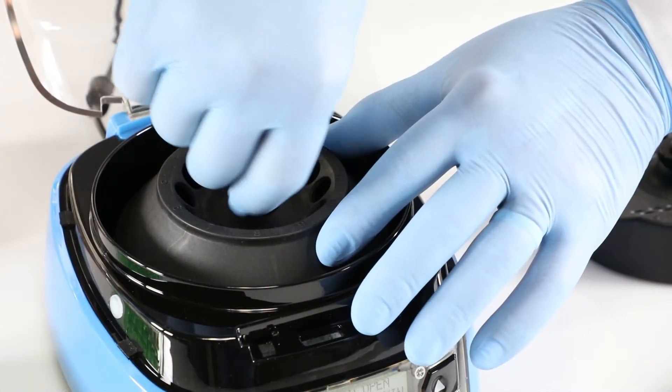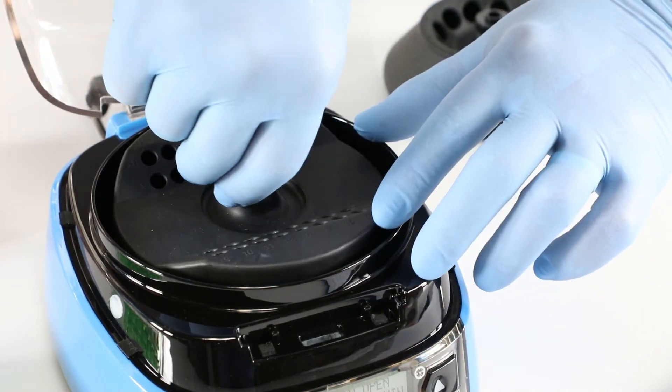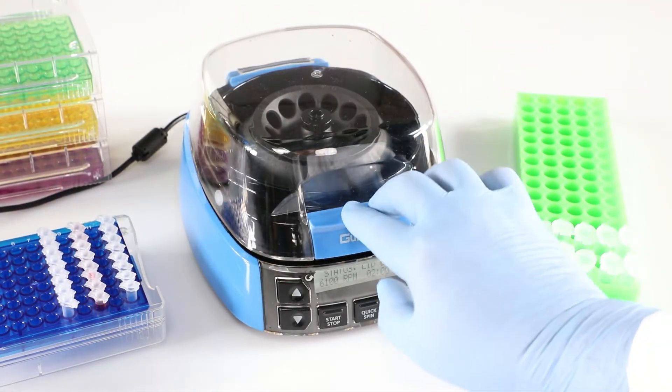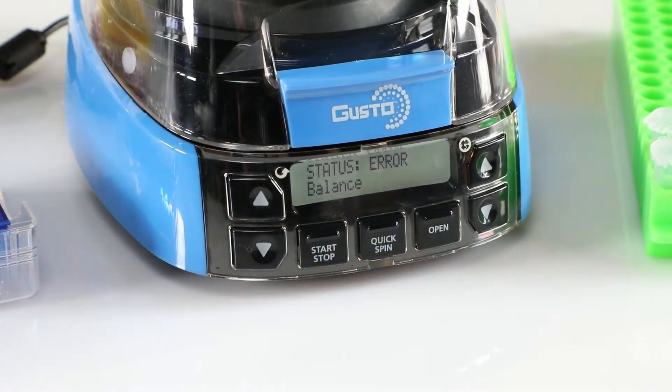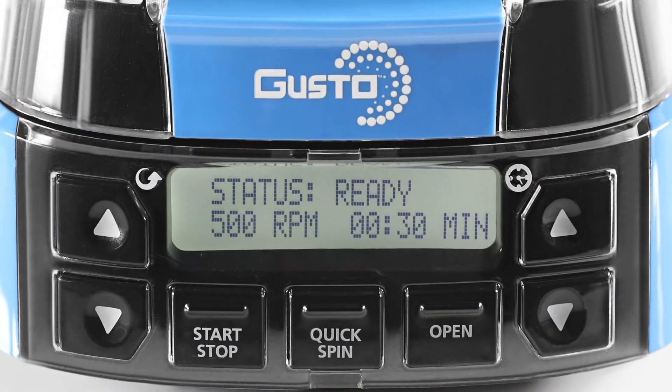Its comfort and ease of use enables quick tool-free rotor exchange, and its numerous safety features help prevent operation when the lid is open, while a rotor is jammed, or if the unit is out of balance. There's even a manual override function that allows users to interrupt a spin cycle.